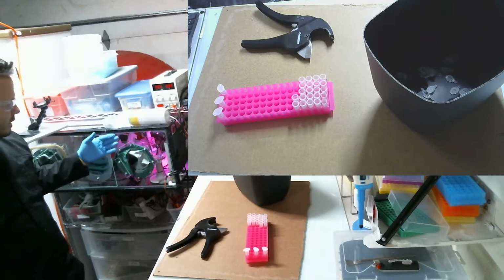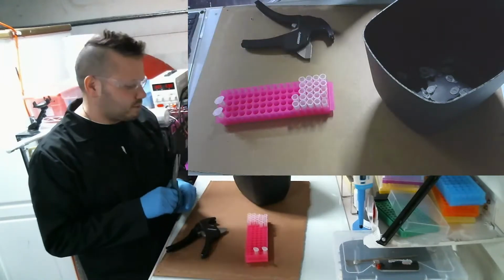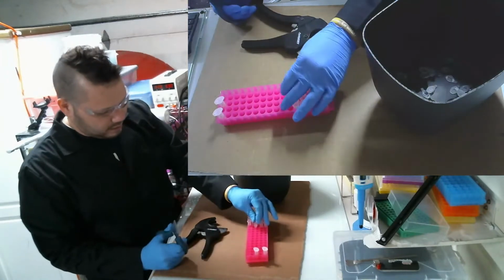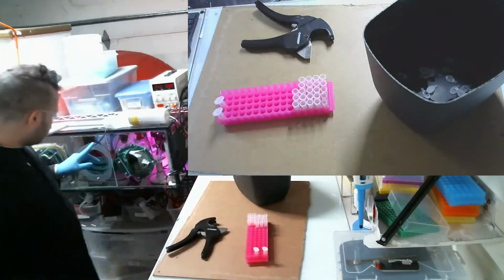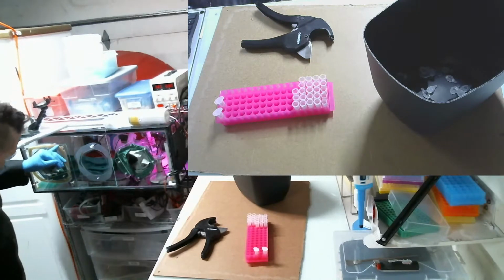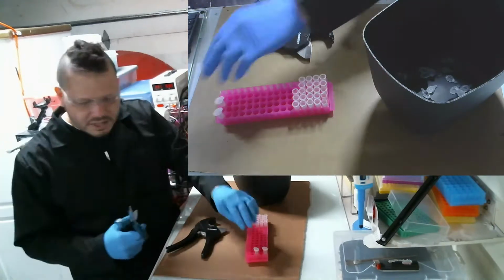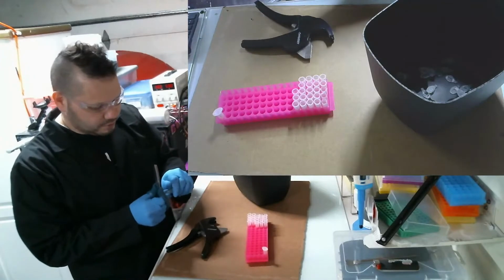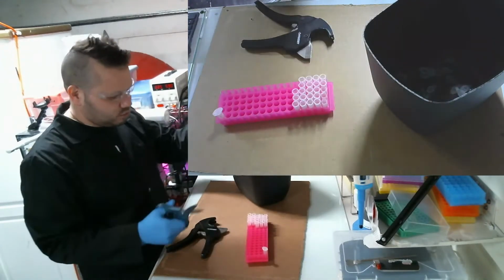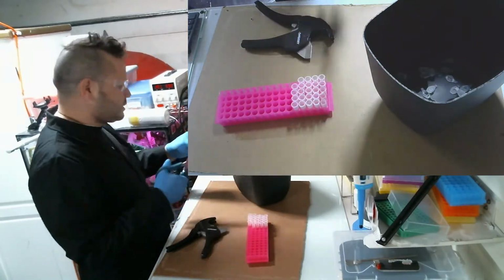The idea is so that I don't have to keep opening the incubator all the time just to do something in there. Obviously, if I have to put stuff in there, I can do that, but if it's just manipulating stuff, I also have a pipette in there, wash bottle, Kim wipes, parafilm, some extra water, petri dishes, sanitizing isopropyl alcohol, and a whole toolbox full of tweezers and all sorts of stuff to be able to manipulate whatever samples I have in there.